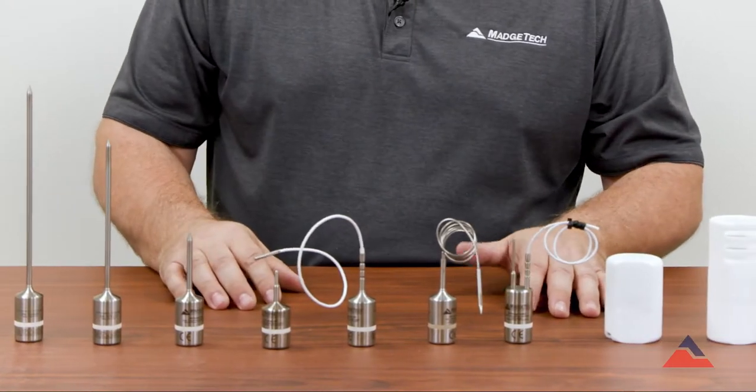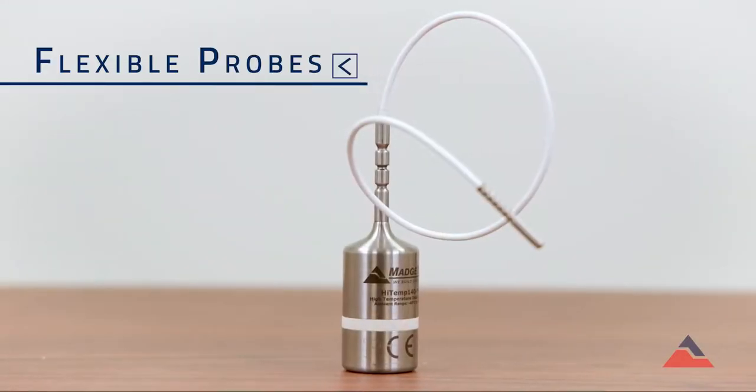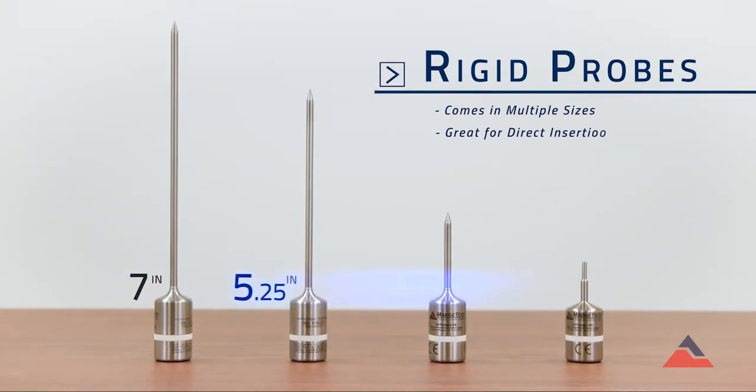We do offer several different probe styles in the HITEM 140 series consisting of rigid probes, flexible probes, and bendable probes. The rigid probes come in seven inch, five and a quarter inch, two inch, and one inch.